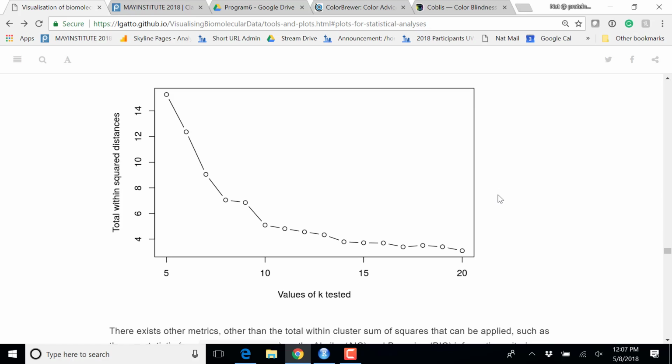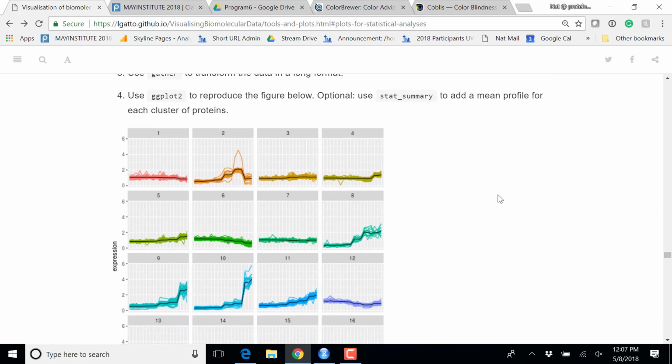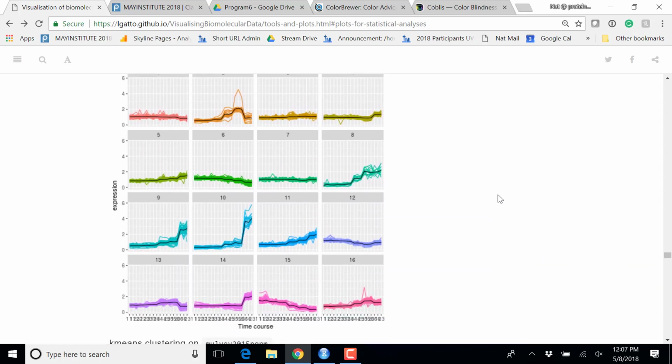So there is a challenge here, and I suggest that maybe that would be one that you could tackle later on for extra practice. This challenge uses the time course data that we see here on the x-axis, which are not well labeled, but the time points are: first time point, second time point, third to sixth time points in every time replicate.